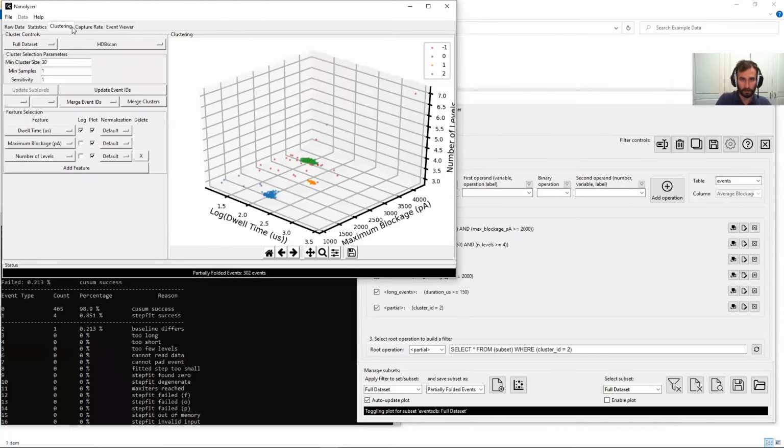And so the clustering here does 2 things, to recap. One, it can be used to label events based on the single entry metadata columns, or it can be used to label the sublevels within events. And I'm not going to get into what you can do with filtering on sublevel IDs just yet. That's going to be the topic of a future video.